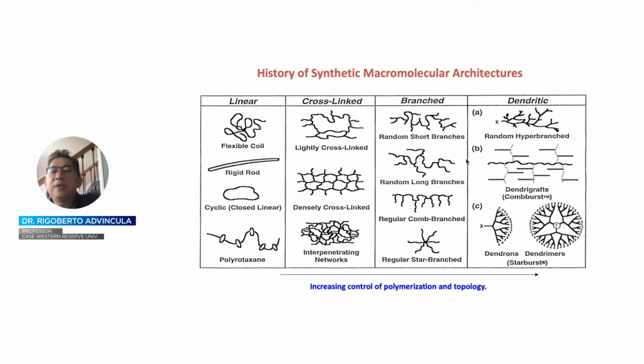In fact, one of the areas that the flow polymerization setup may lead to is control of these process parameters together with the introduction of monomer, leading to a controlled distribution or product architecture of the polymers that is desired. So by that description, I'm lending this proposition to those who are interested in artificial intelligence or machine learning: coupled with control in flow chemistry and the feedback loop that can be integrated, one can easily imagine the use of AI and ML towards optimizing reactions using a flow chemistry setup.